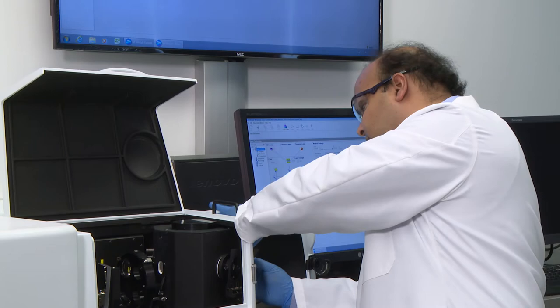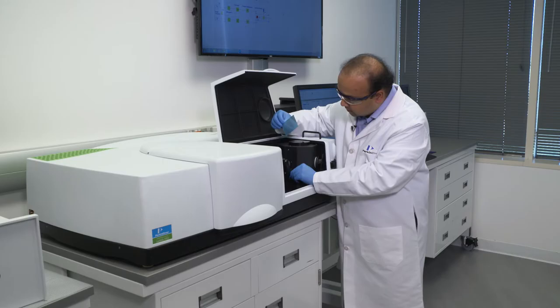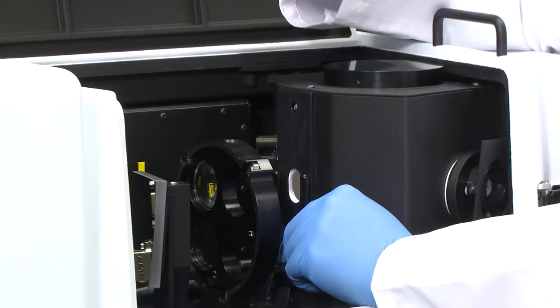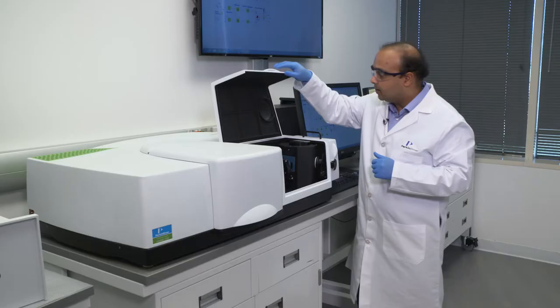So we'll close this large door here, the spectrometer is going to auto-zero, and let's say if you have to measure the transmittance through this film, this polymer film here, the transmittance port at the very front of the sphere is spring loaded, so we can very easily position this polymer sample over here.